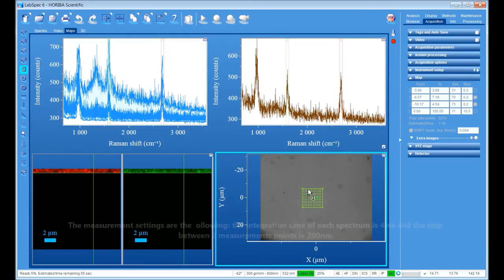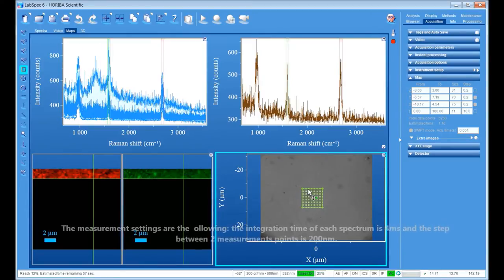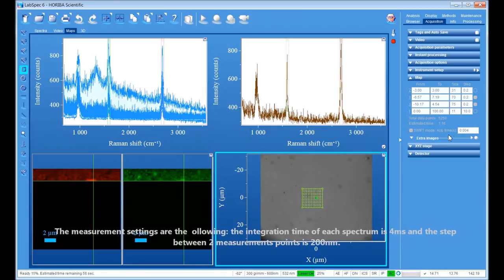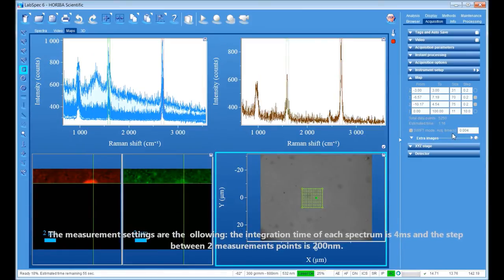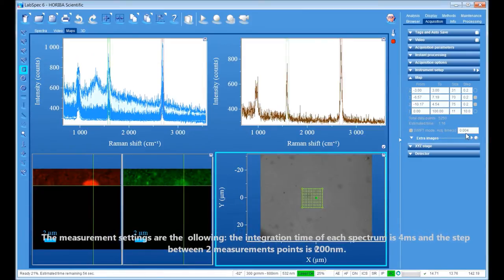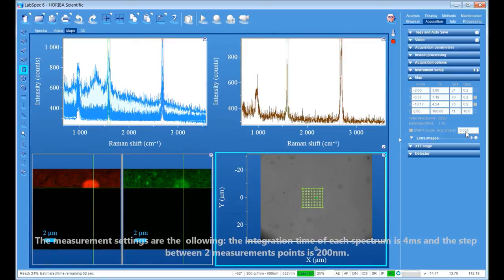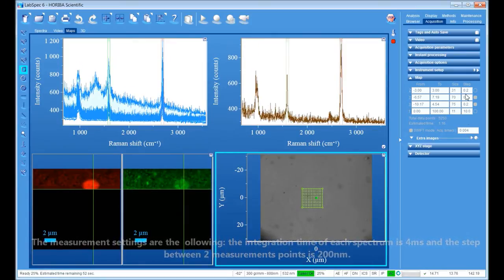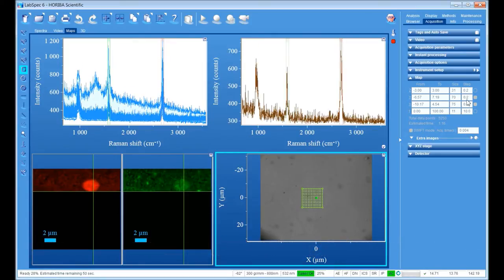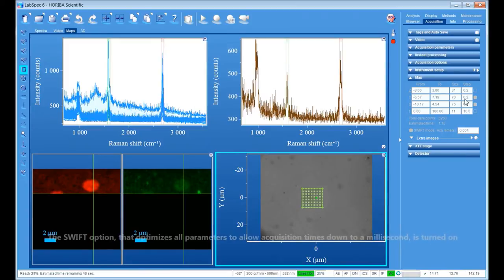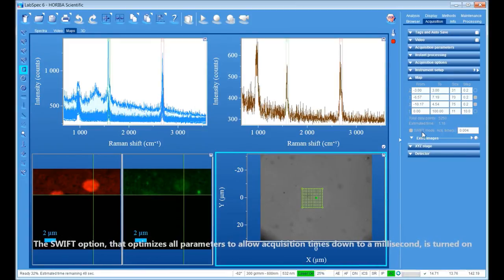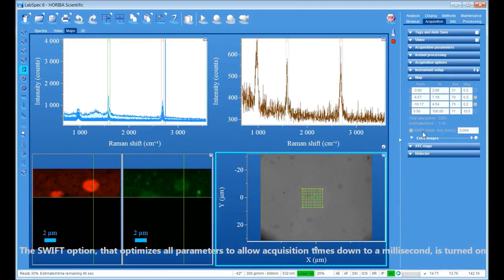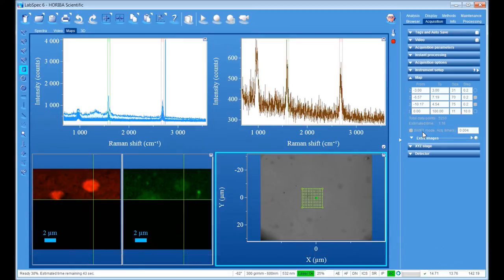The measurement settings are the following: the integration time of each spectrum is 4 milliseconds, and the step between two measurement points is 200 nanometers. The Swift option that optimizes all parameters to allow acquisition times down to a millisecond is turned on.